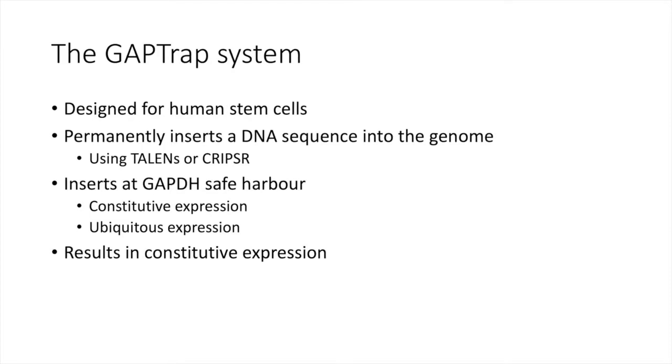So the GAPTrap system is an expression system that is designed specifically for human stem cells. The GAPTrap system works by inserting a DNA sequence of your choice into the human genome using either TALENs or CRISPR, and it inserts this sequence of DNA at the GAPDH safe harbor.